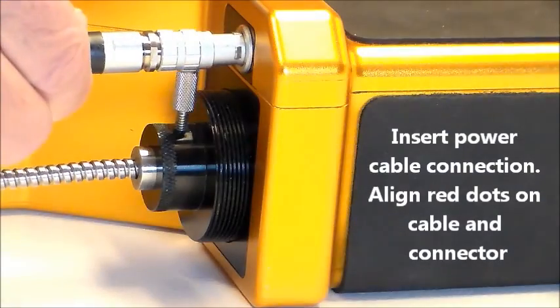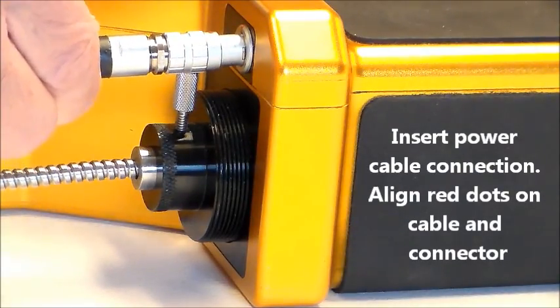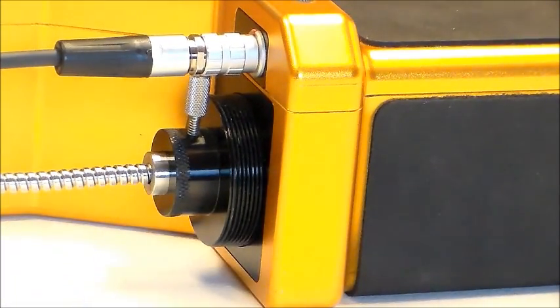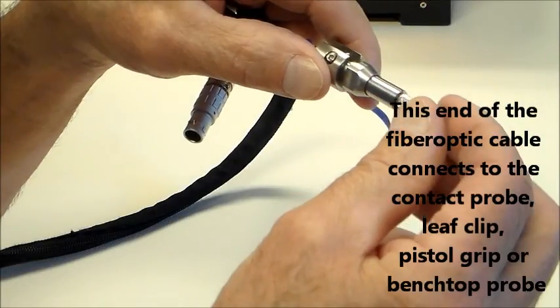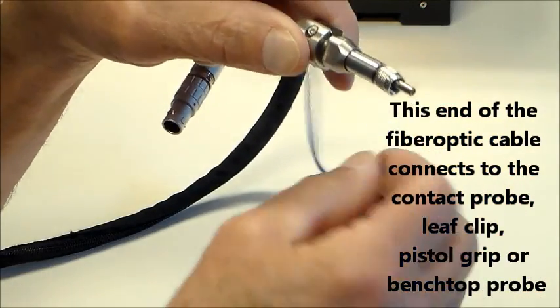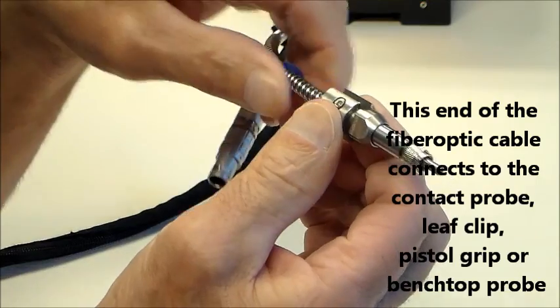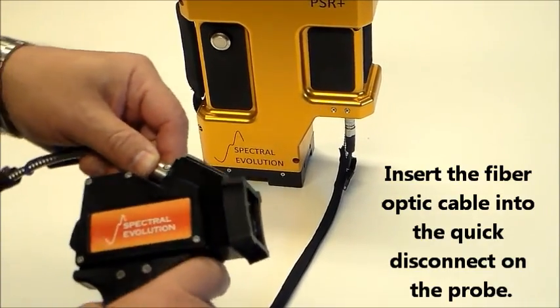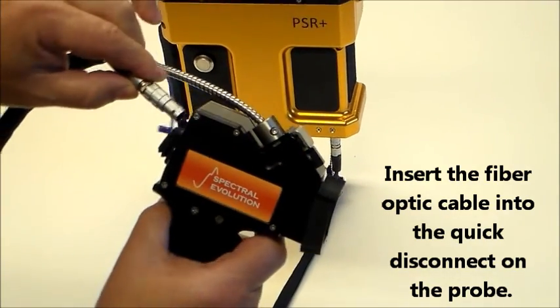Line up the red dots and connect the power cable to the PSR Plus. The thinner end of the fiber optic cable — the SMA905 connector — is inserted into the contact probe, leaf clip, pistol grip, or bench top probe. The power cable and fiber optic cable are both connected to the PSR Plus.